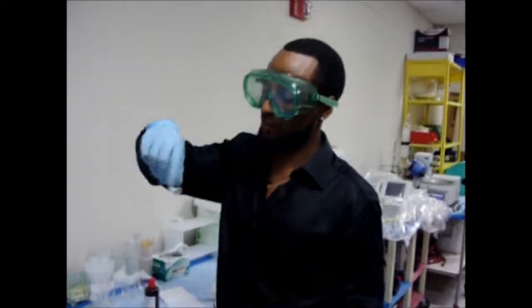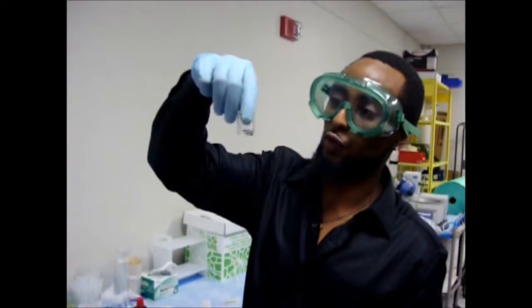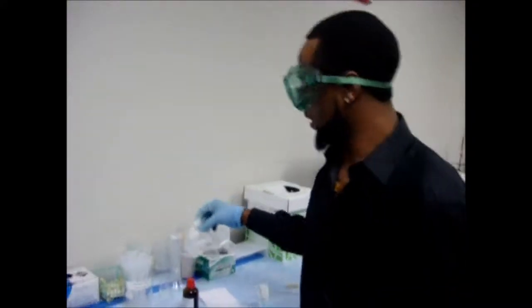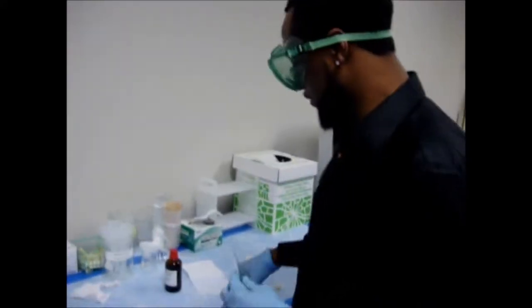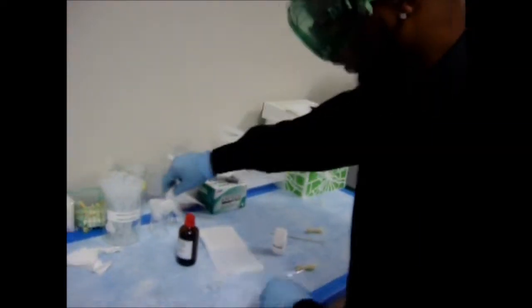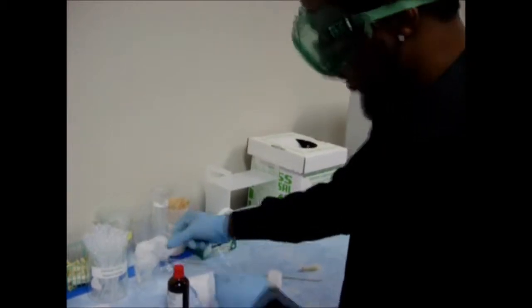So after we have dissolved our Lidocaine in chloroform, our very next step is to use some type of wool material so we can filter out anything that isn't dissolved, because we can't put anything that isn't dissolved in the NMR because it will throw off the nuclear magnetic resonance. So what we would do is put a piece of wool into our tube right here.